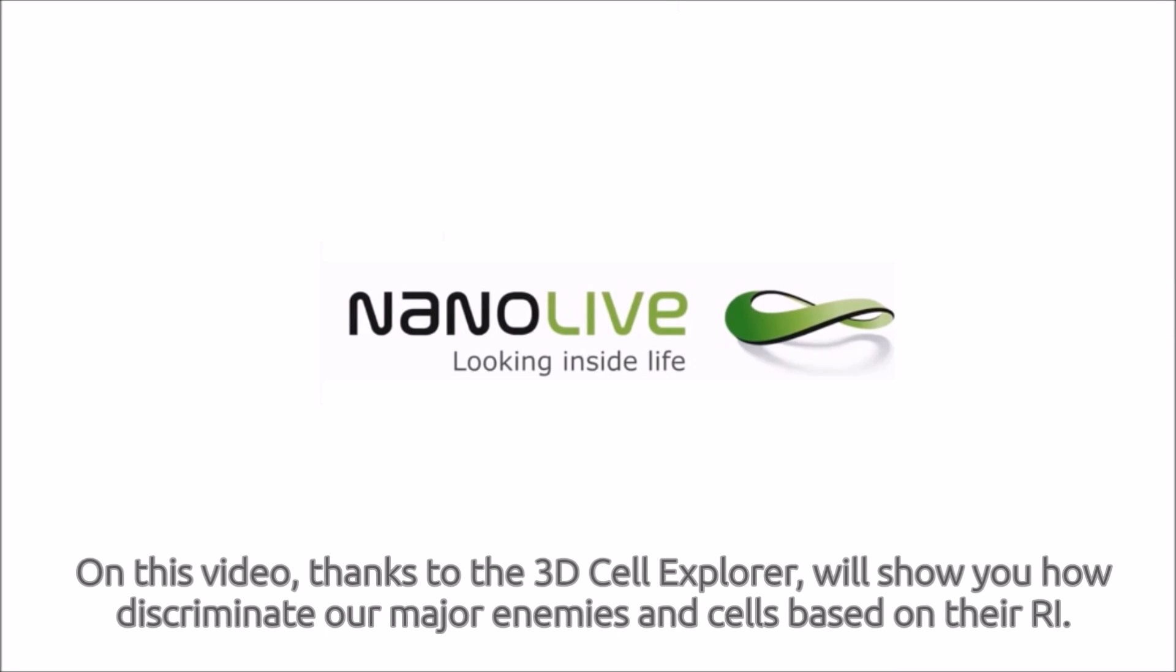On this video, thanks to the 3D Cell Explorer, we will show you how to discriminate our major enemies and cells based on their refractive index.